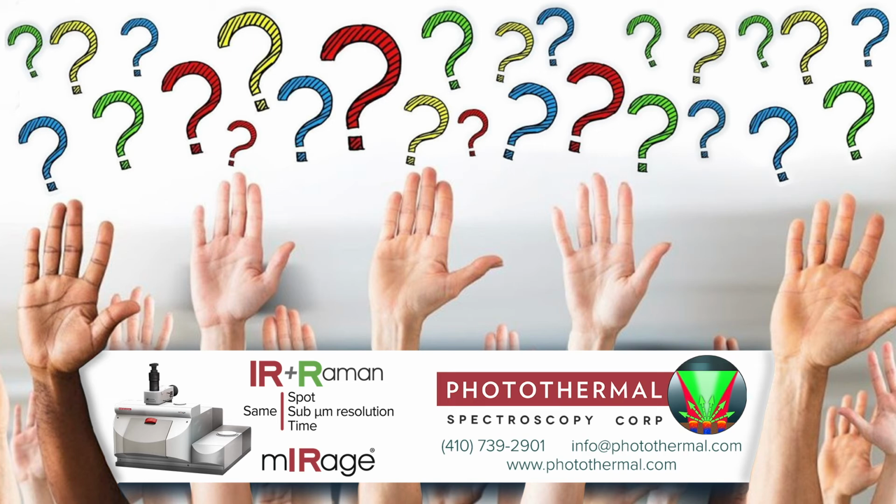Hi. Have you considered fusing the data and actually processing the two data sets together, sort of a data fusion concept, and are the results any different, better? Like Raman and infrared? Yes, Raman and infrared. So usually people do that when they don't have good discrimination using them separately, right? And we got some down.